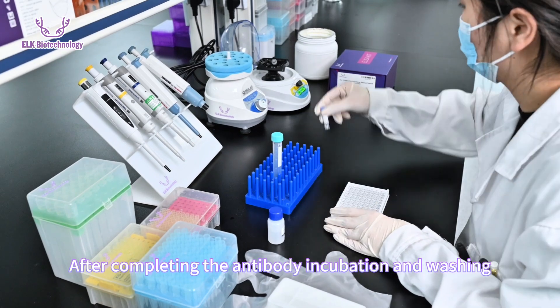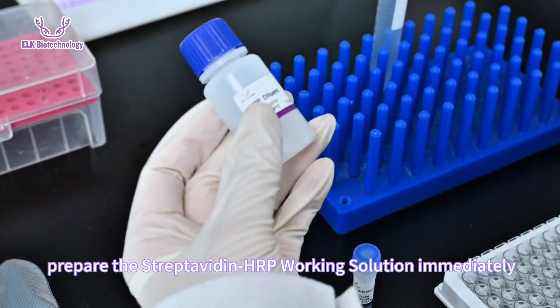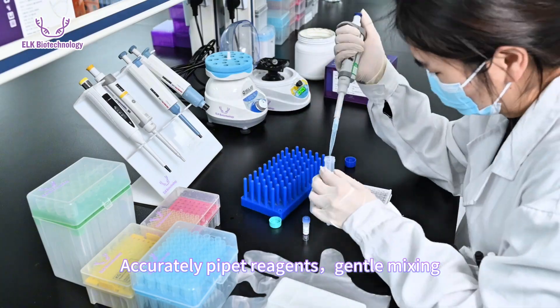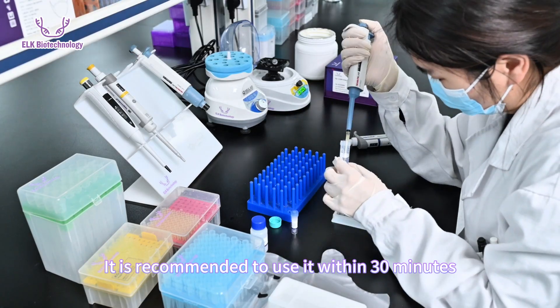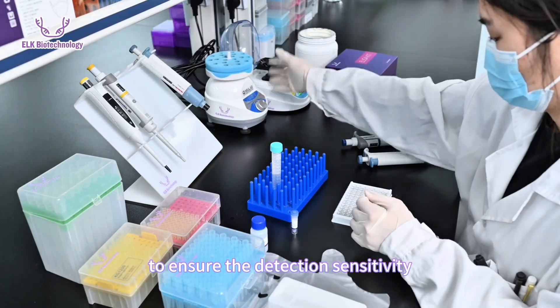After completing the antibody incubation and washing, prepare the streptavidin-HRP working solution immediately. Accurately pipette the reagents with gentle mixing — avoid severe shaking. The working solution should not be left for a long time; it is recommended to use it within 30 minutes to ensure detection sensitivity.